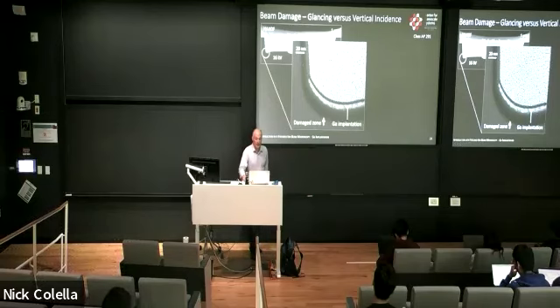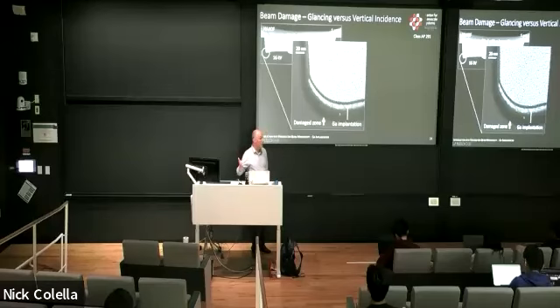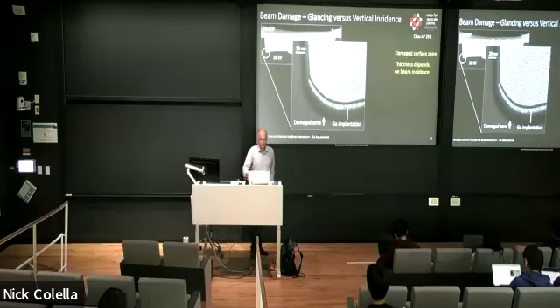So this is where the gallium ions have, ultimately, the dark region represents a zone where the crystallinity has been completely destroyed. This is silicon, and silicon tends to amorphize. So the dark band represents the location where the material has been amorphized. And the brighter regions represent where the gallium has been implanted.